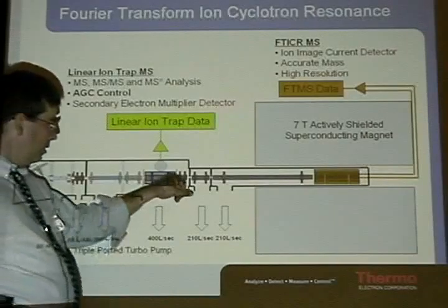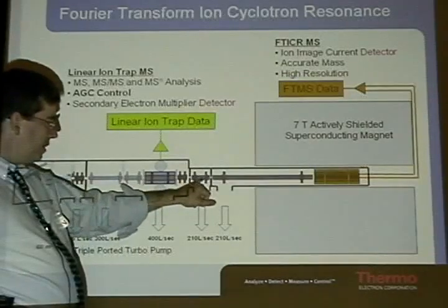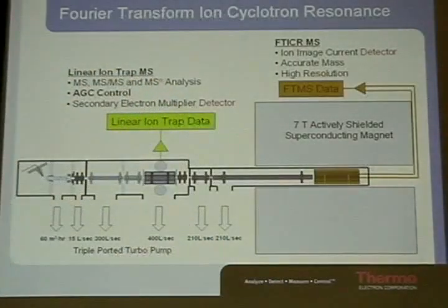Inside it has a short multipole, a medium length multipole, and a really long multipole, and then a 3-segment trap. Now, the pictures we show is not what you actually get. We actually do somewhere between a true 3-section trap, which is the normal academic trap, and the Bruker infinity cell for quantitative work. Ours is somewhat halfway in between. It's not enough infinity cell to infringe on patents, yet it's good enough to get decent quantitation off of.